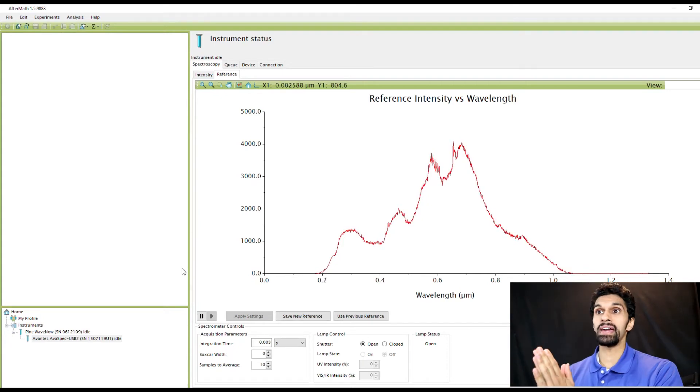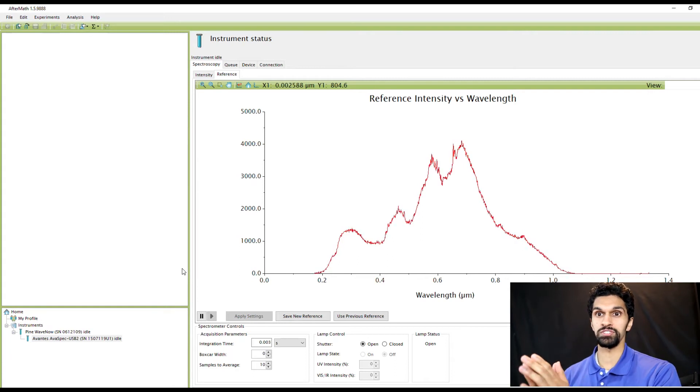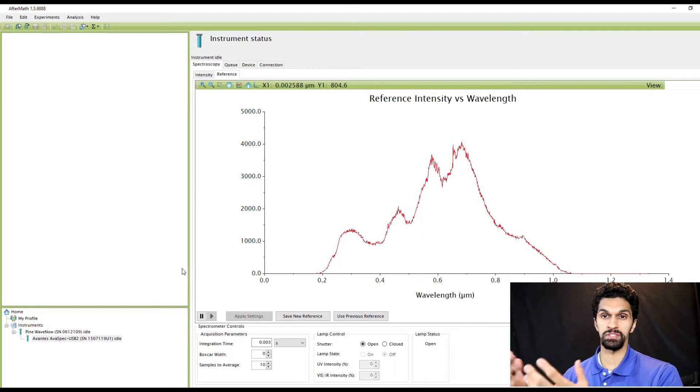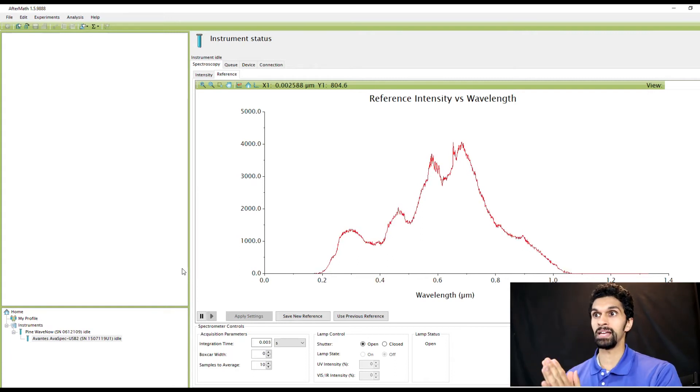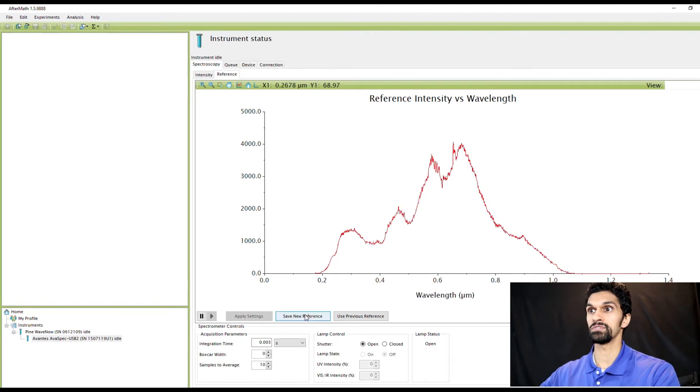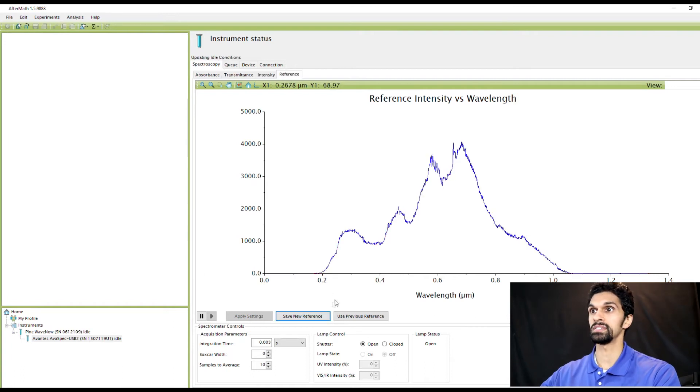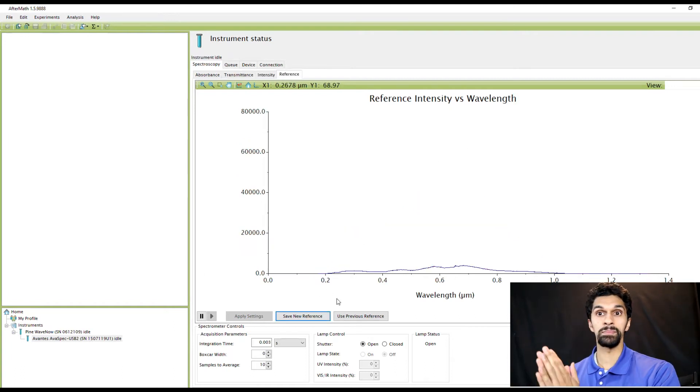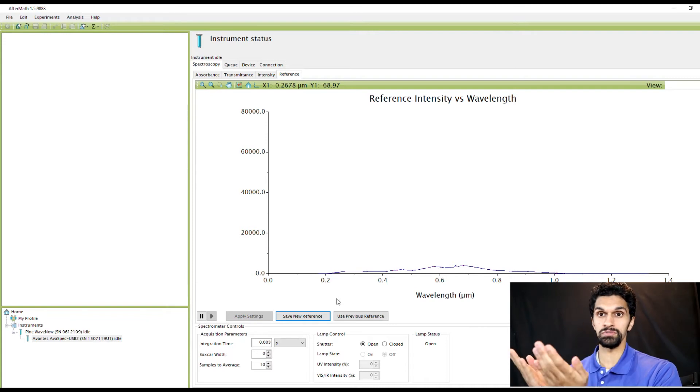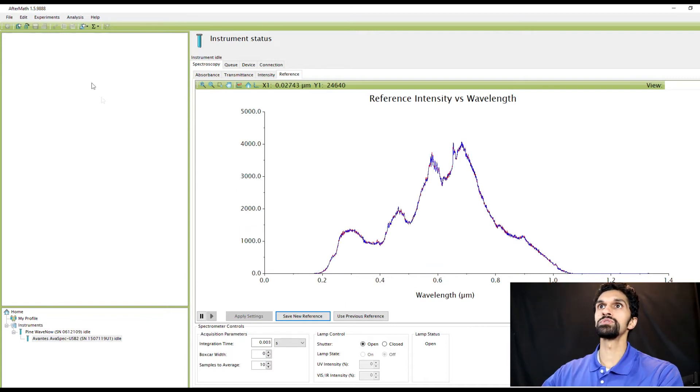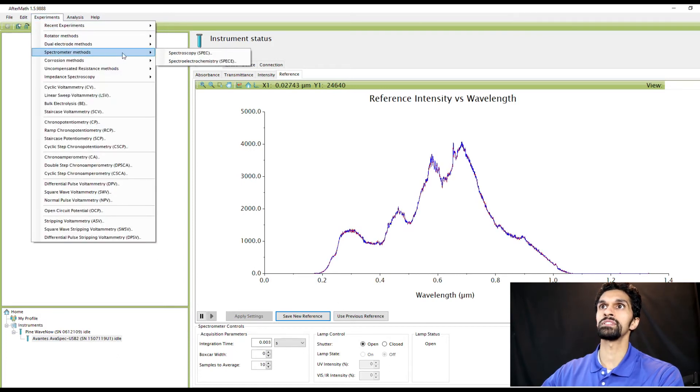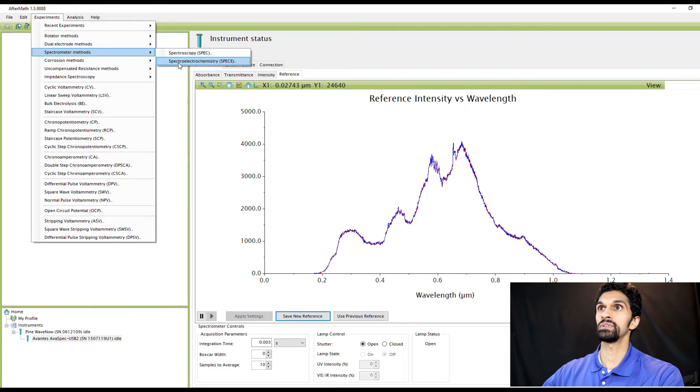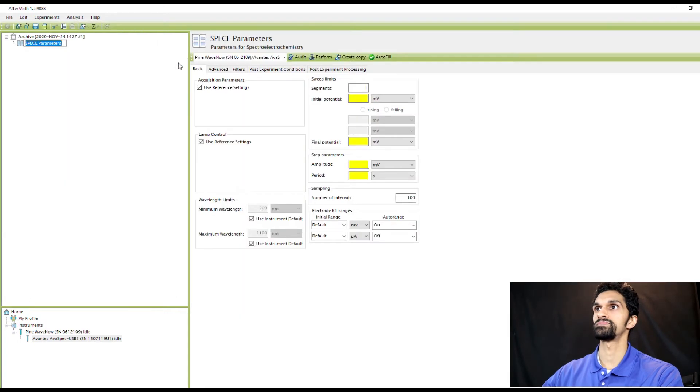Now that I have my honeycomb spectroelectrochemical cell with methyl viologen set up, I'm now going to hit Save New Reference. Now I'm going to go and actually create a spectroelectrochemistry experiment. To do that I'm going to go to Experiments, Spectrometer Methods, Spectroelectrochemistry, click here.